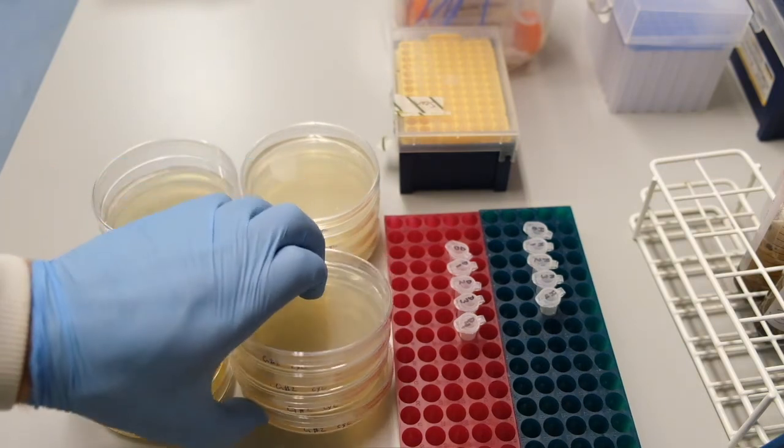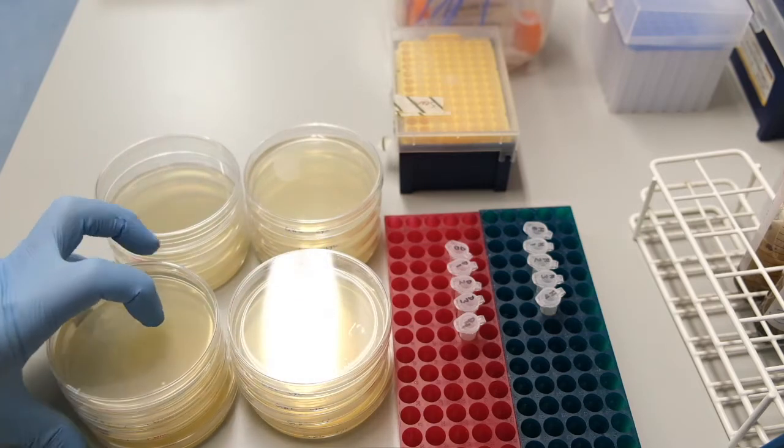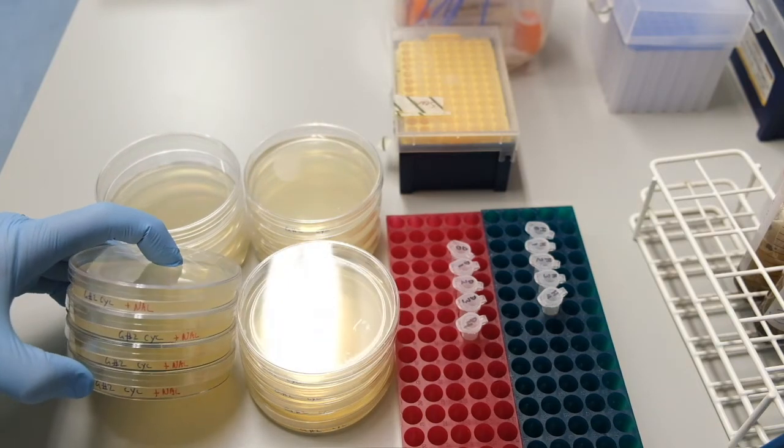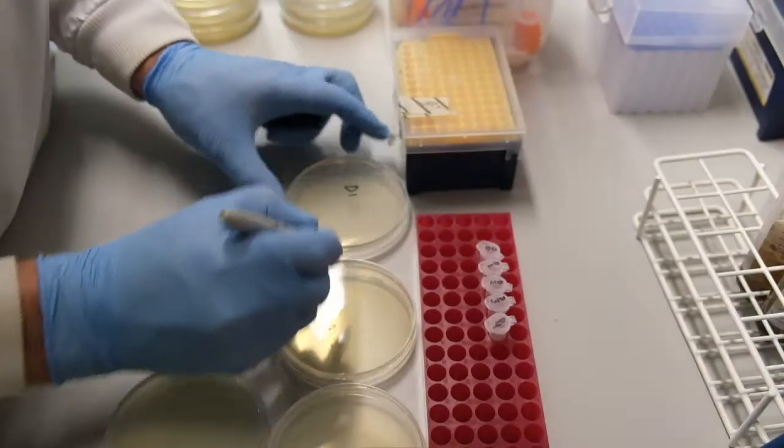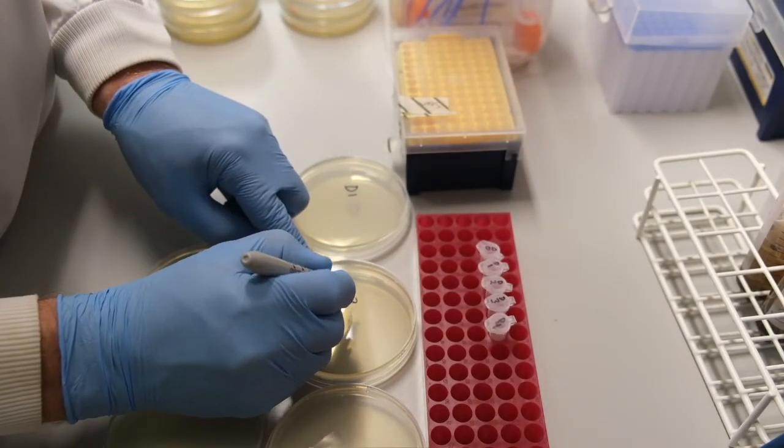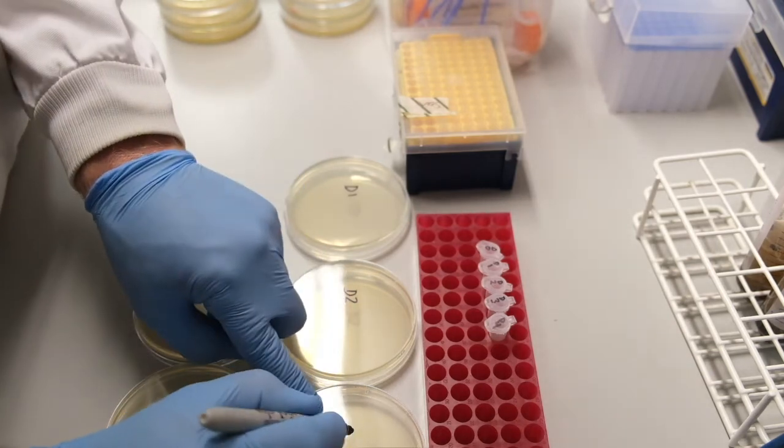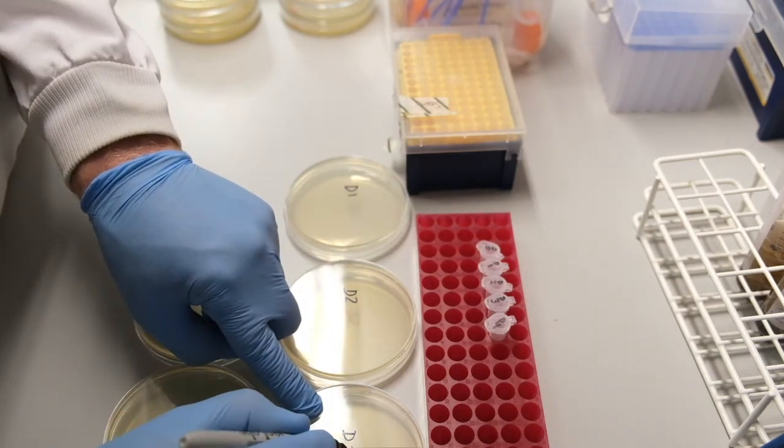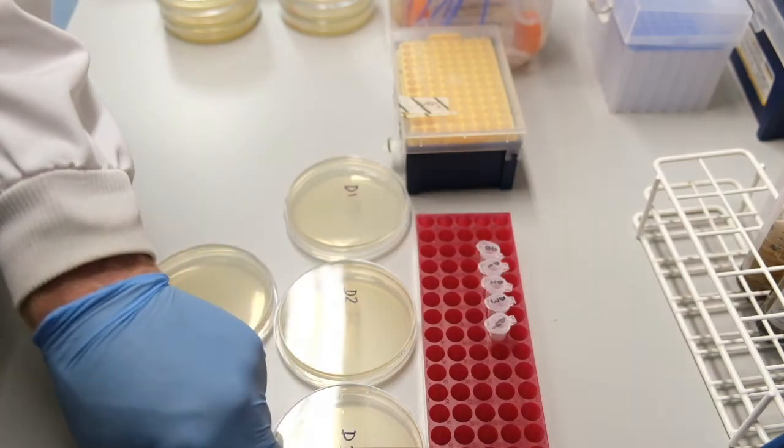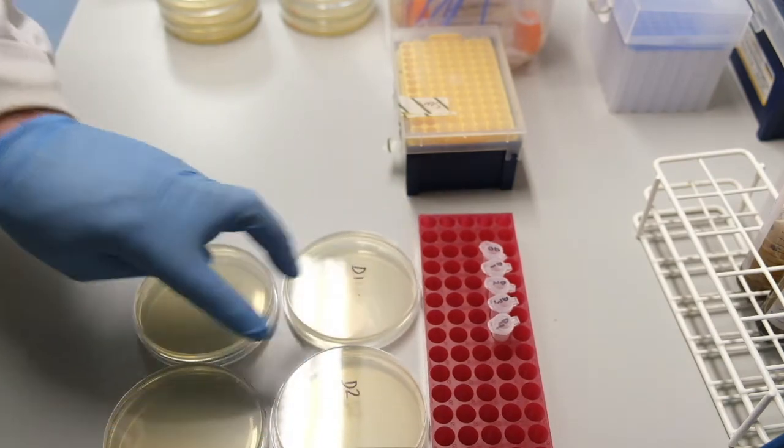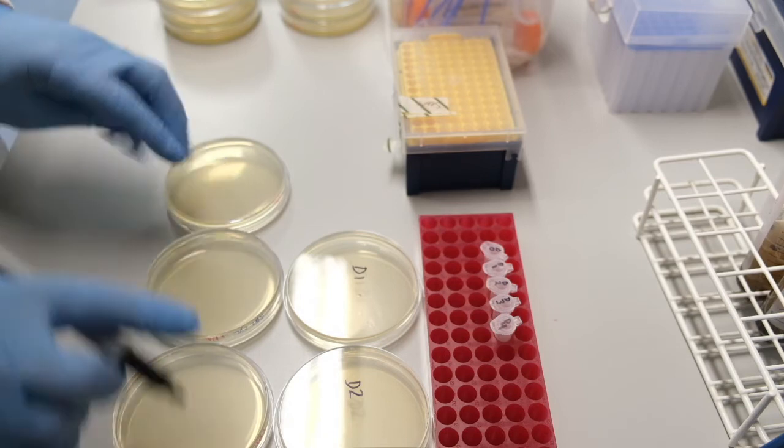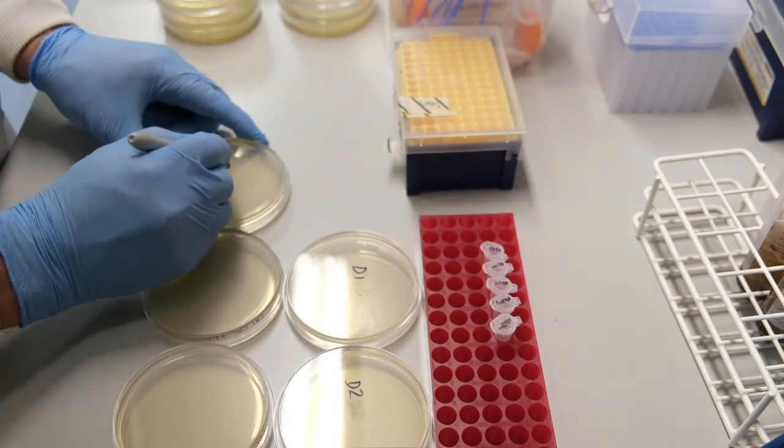We also have poured 8 Gause No. 2 agar plates containing cyclohexamide, and another 8 plates containing cyclohexamide and nalidixic acid. Cyclohexamide inhibits growth of fungi, nalidixic acid inhibits growth of many gram-negative bacteria. We label our plates as described in the lab manual.